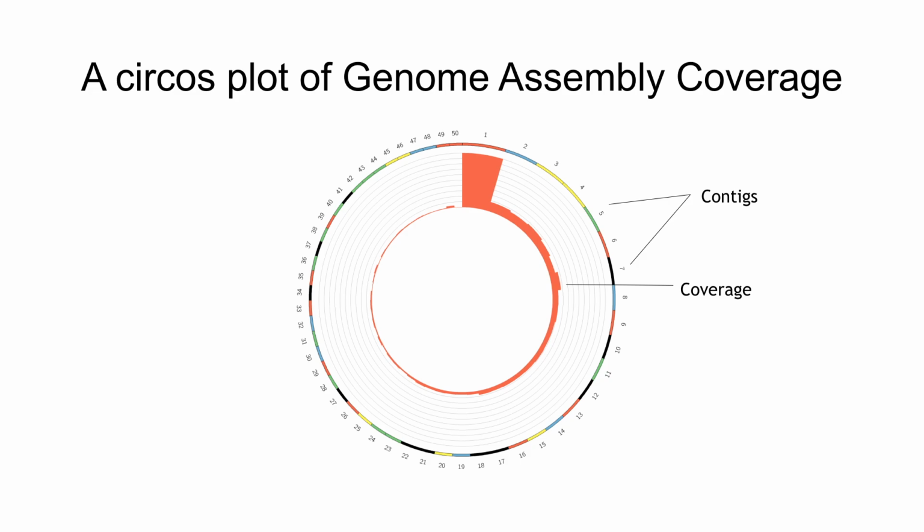If you want to follow this tutorial, you need to make sure you have Circos installed. For this tutorial, we are going to use the command line version. But if you don't have Circos installed, don't worry. In the next episode, I'll make a tutorial that shows how to run Circos on Galaxy to generate this same data. Just make sure to follow and understand the steps, and then in the next episode, you can use your browser to generate this plot.